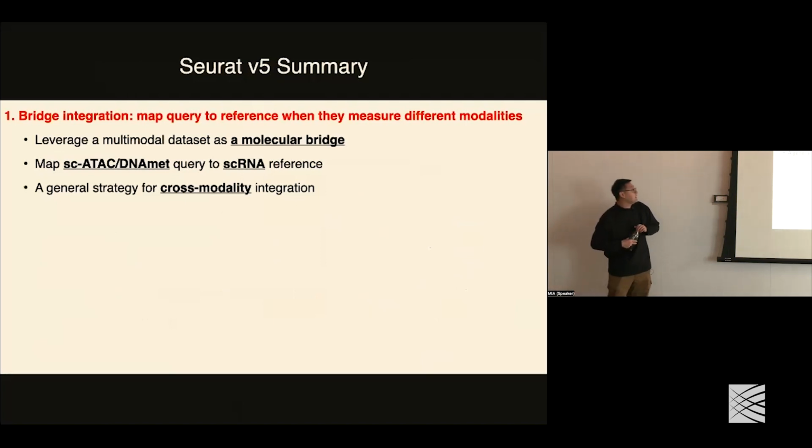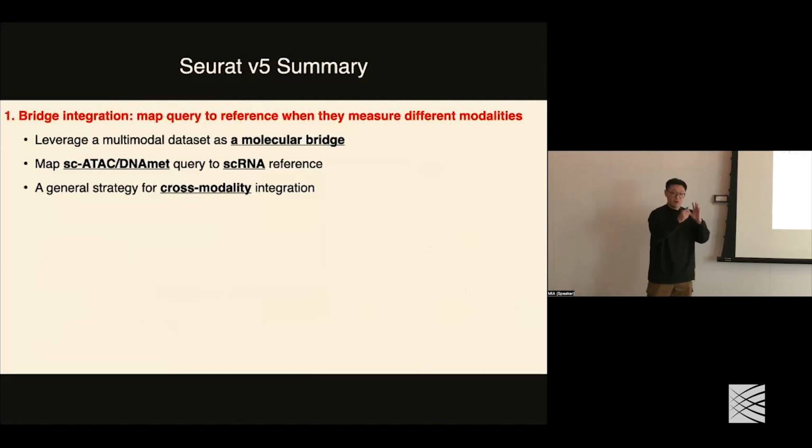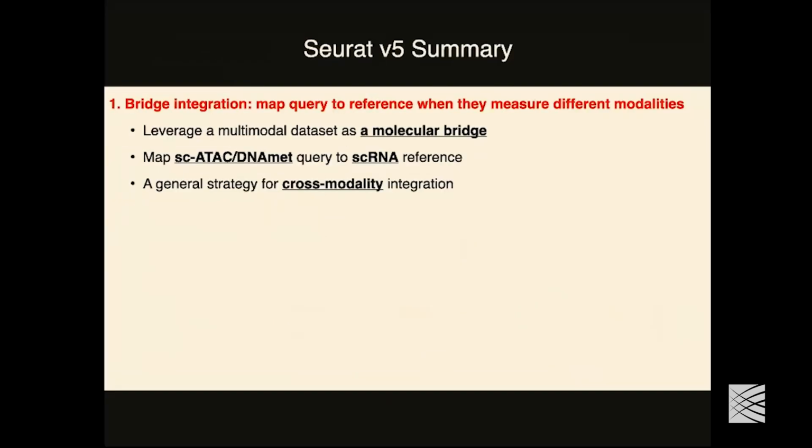So you can see here we can use the multimodal data as a molecular bridge. And this is a general framework. When you have a bridge to connect a new modality, then this bridge integration method can work there. Yeah, just about the Seurat.